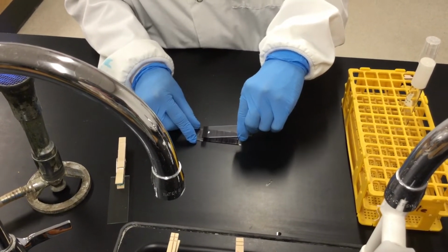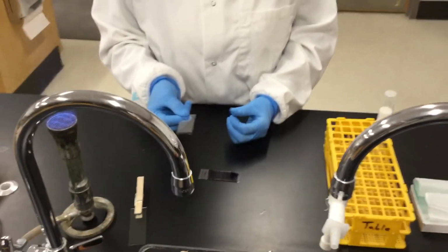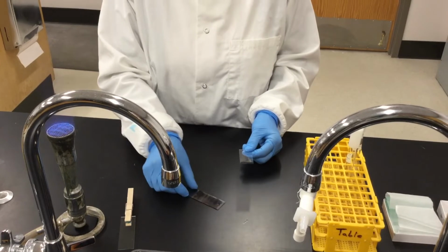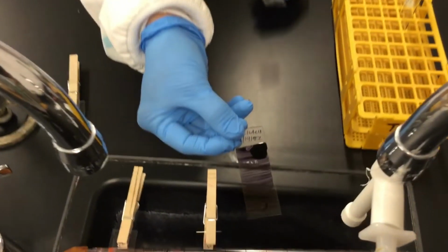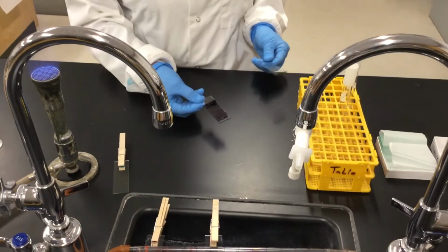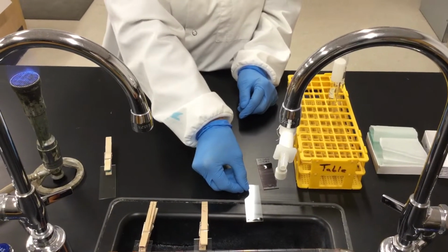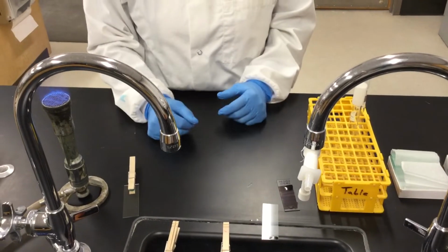And don't let it fall, otherwise you will have your slide all stuck with this other one, and then you won't be able to see anything. So this is how this type of staining looks like. And then I'm going to put it for now here on the countertop. And you're supposed to have as well a beaker with disinfectant, which you will have.